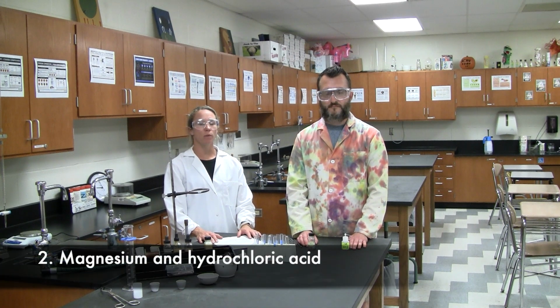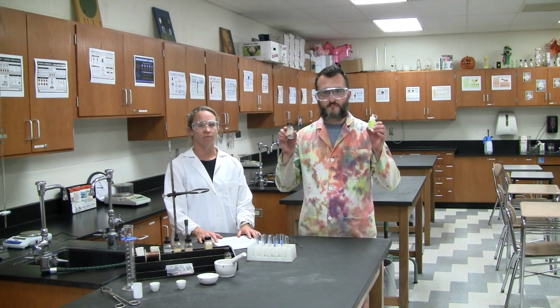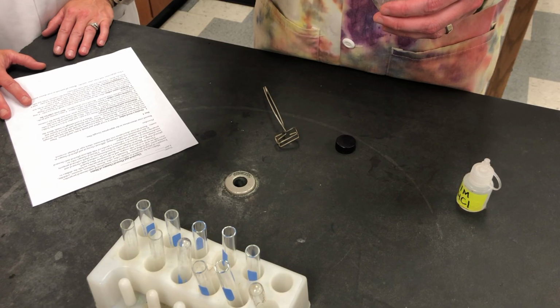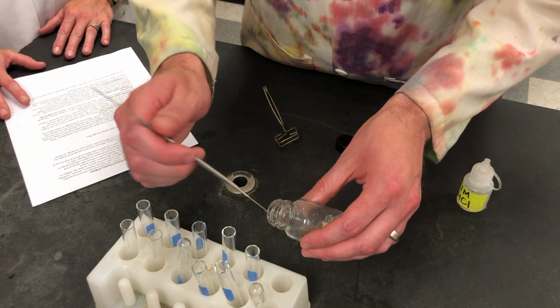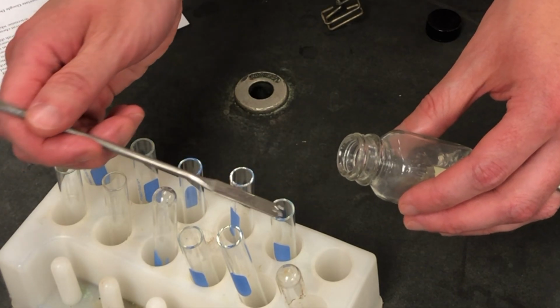In investigation number 2, we'll be adding magnesium and hydrochloric acid together. Holding the bottle at an angle and using a microspatula, add a small amount of magnesium into the test tube.